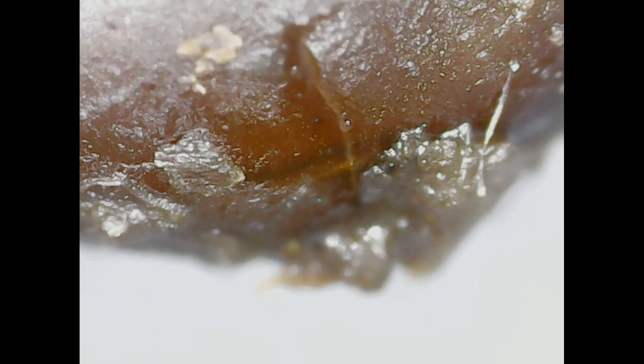And right now I'm kind of focused on the side. Try and focus on that crack right there. Sometimes they'll open up on the side and the worms will come out sideways. You'll find cocoons that are split. No, I don't think it's actually cracked open. I think it's just an irregularity in the shell. Pretty interesting stuff, though. Very, very, very cool.